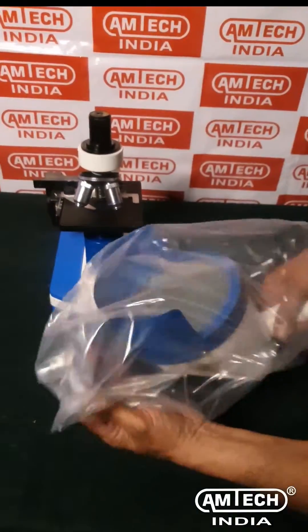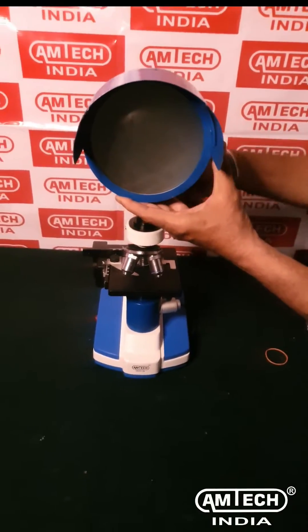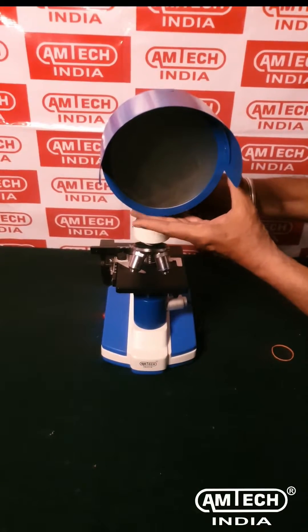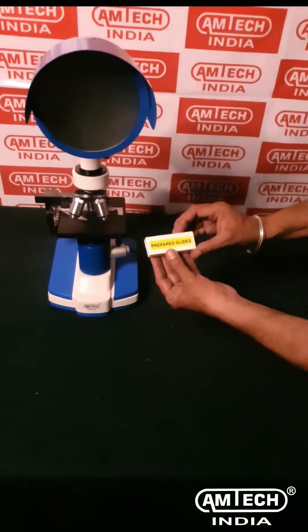Place the projection microscope dome above the microscope tube and tighten the screw. Insert the prepared microscope slides above the coaxial stage.